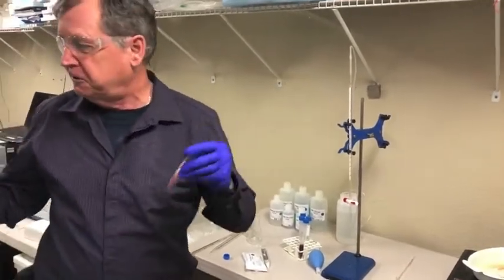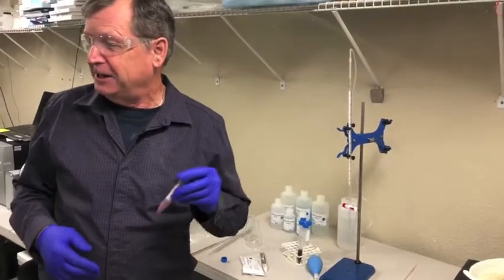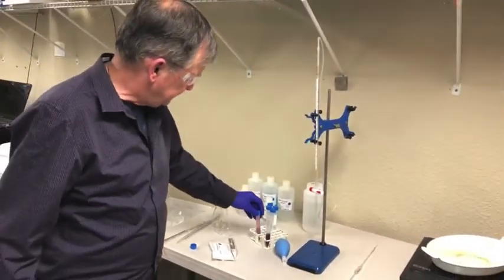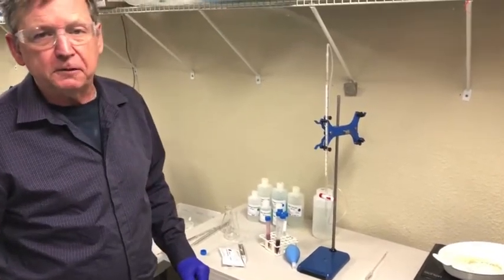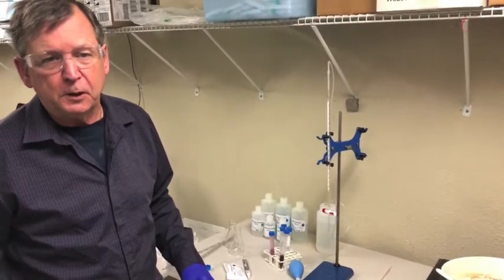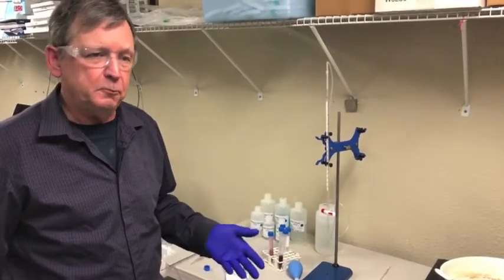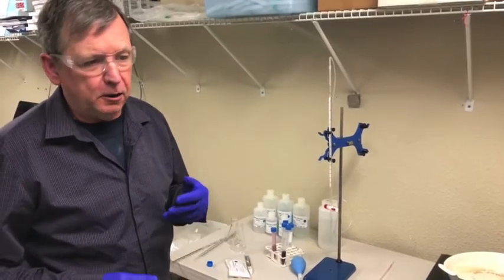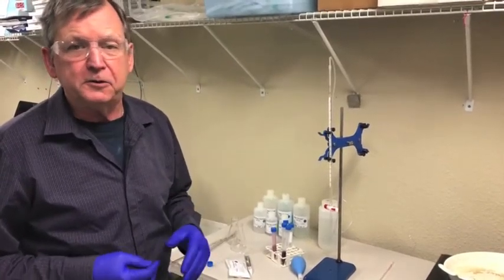We have a centrifuge in our lab so we're going to use that, but if you don't have a centrifuge you can put it upright and let it settle — sometimes it might take about two hours. Or if you have a filtration setup with filter paper, you can filter it. All you need is two milliliters for the next step.